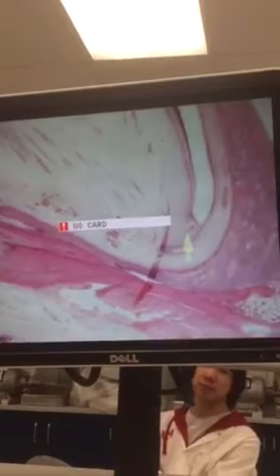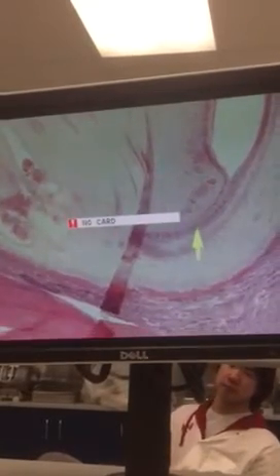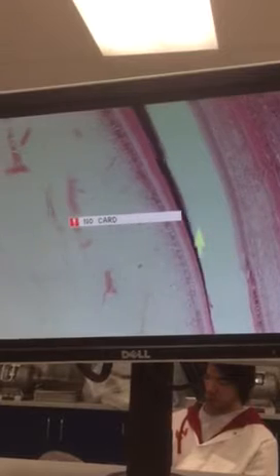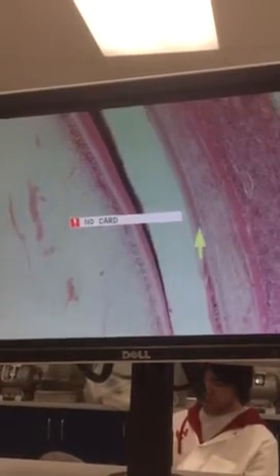And the thing to look for on this slide is not so much the formative stages. We have organizing down here. So as we follow these ameloblasts along, there's the enamel right there. There's dentin, there's predentin. Quite a bit of shrinkage has gone on in this particular slide. But as we follow this up, now we can see that they're nicely attached right there. And you can see some of the substructure in the enamel.